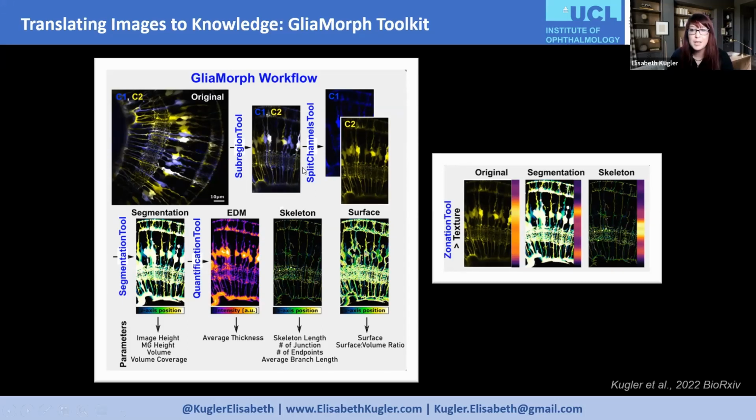So something that's meaningful for us as biologists to really interpret the data that we're looking at. And each one of these different subsections will be discussed by someone in the team today.